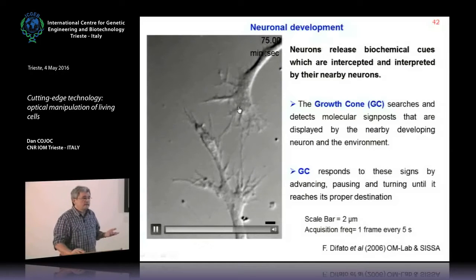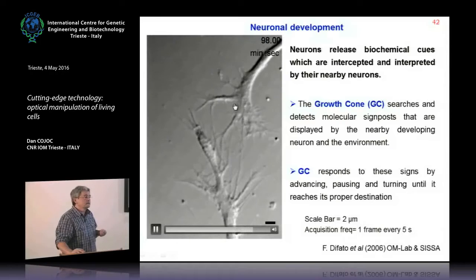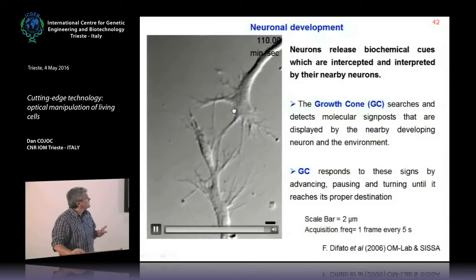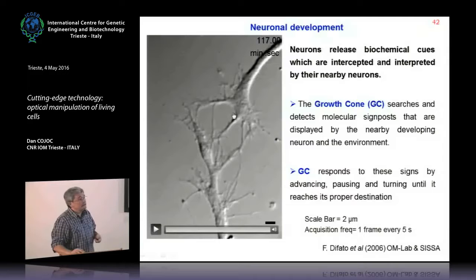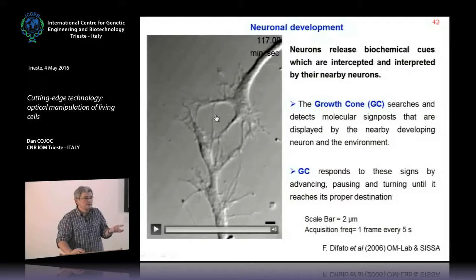As we can see, probably the language also includes other things, because there are chemical signals transmitted to each other. You see that there are a lot of contacts, there is a displacement, they seem to like each other and to connect, because they are growth cones, at the beginning of the network formation, which is very important, the first 2 days, when it is very important how the neurons connect to each other.